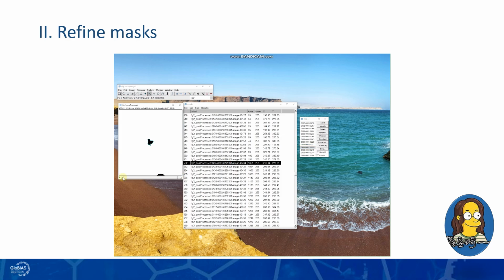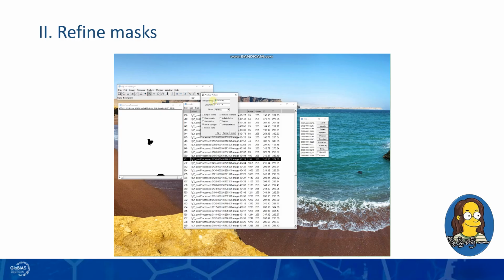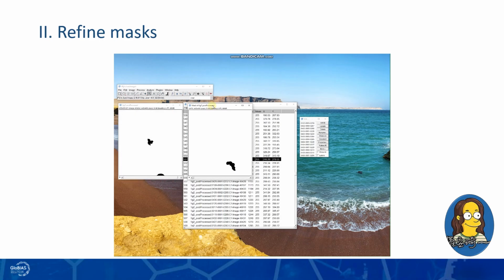Now, we know that the largest debris area is 151 pixels. Let's run Analyze Particles one more time. This time, set the size range from 152 to infinity and choose Show Masks. After running the analysis, the debris objects smaller than the target cell will be removed. Finally, we obtain a clean image stack that's ready for contour extraction.